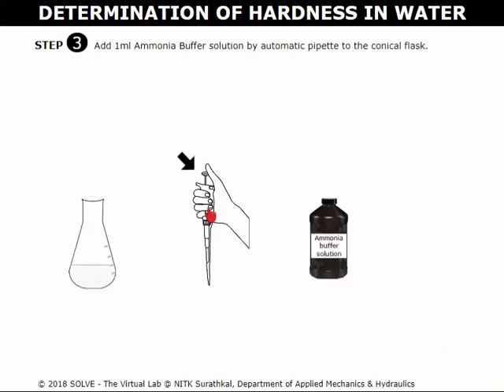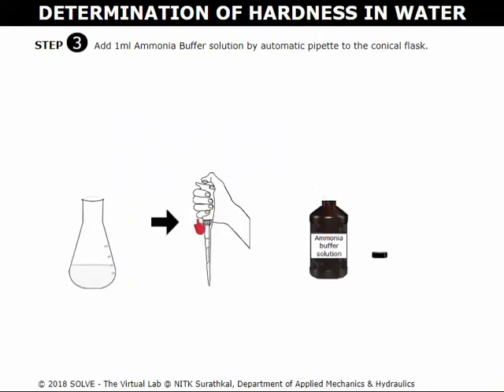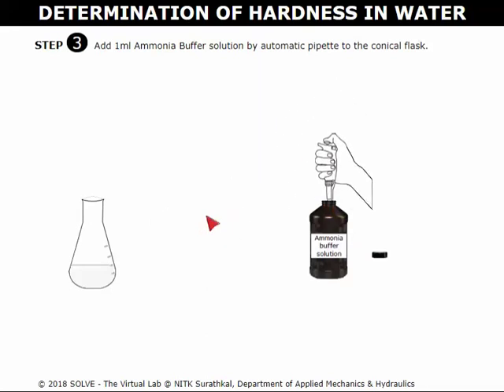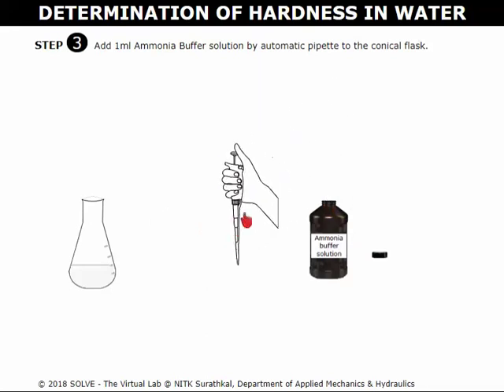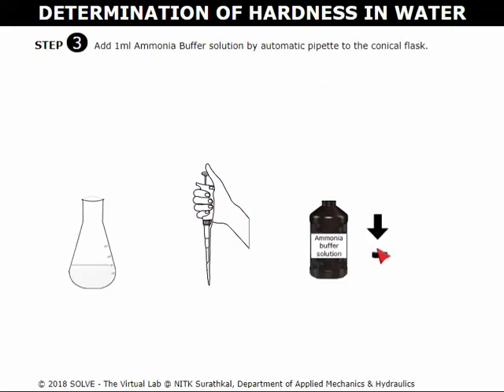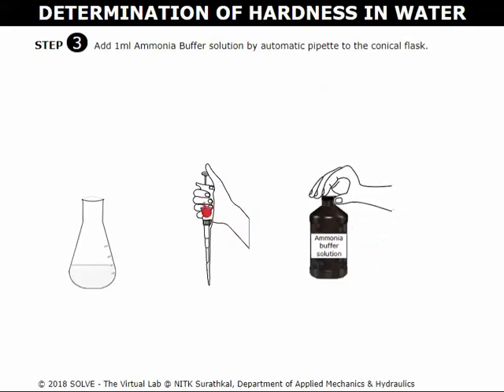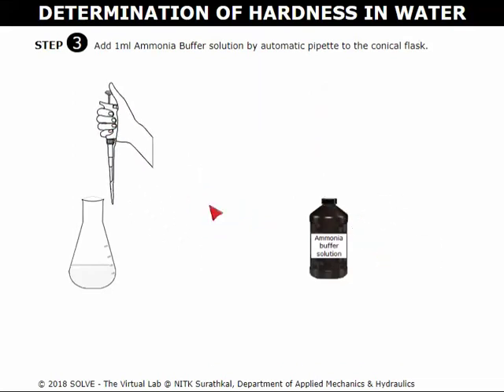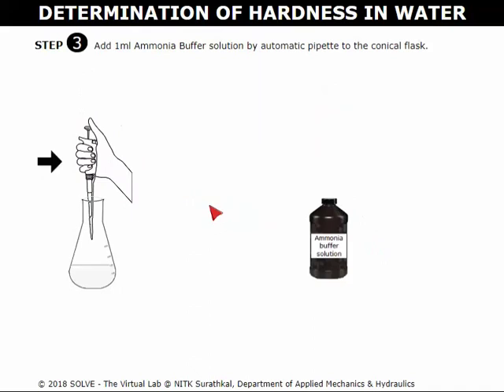Click on the automatic pipette. Click here to open the lid of the ammonia buffer solution. Now pipette 1 ml of ammonia buffer solution. Close the lid. Click on the pipette and release the solution into the conical flask.